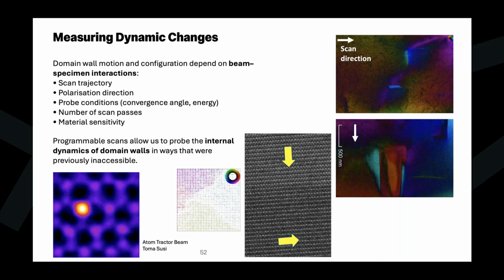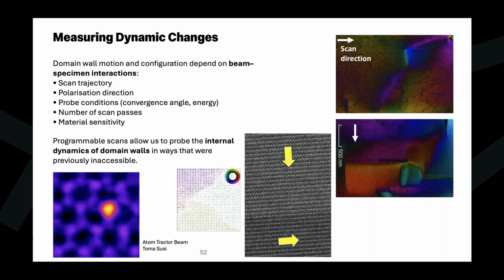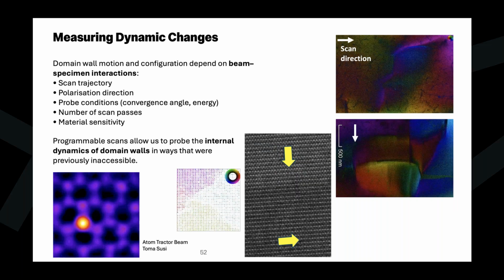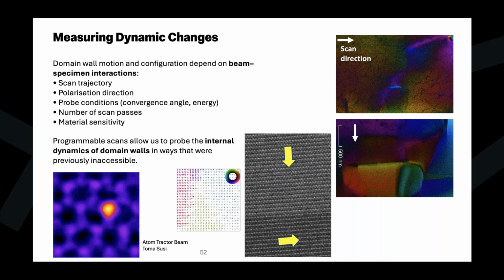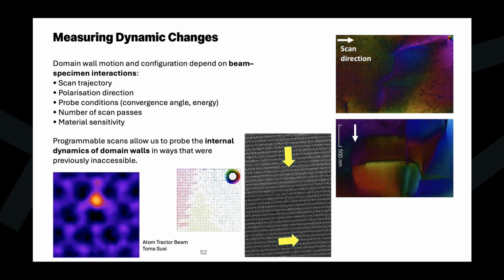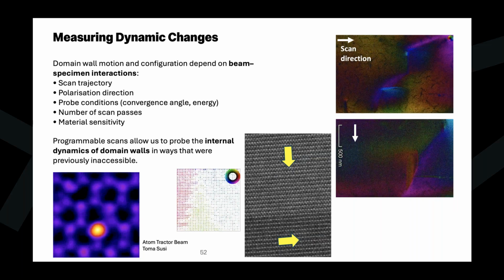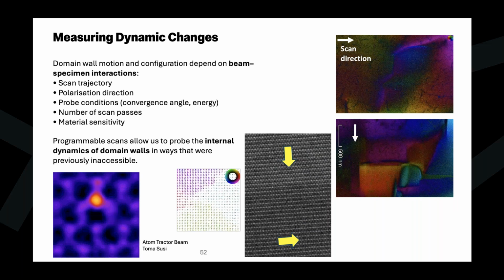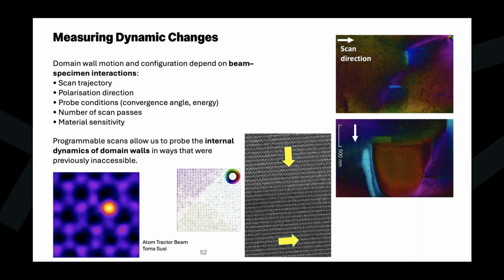But until very recently, working in collaboration with Liam Spillane at Gatan, now we can actually move the electron beam in loads of different directions. So it's wonderful in one case for changing the different scan patterns to avoid beam damage, but also for our research, at least within Imperial, we want to look at how we're changing the different ferroelectric, ferromagnetic domains using different scan trajectories.